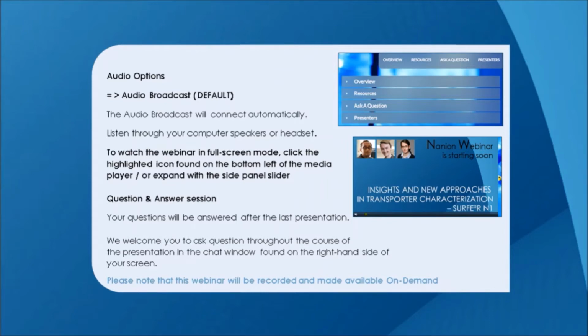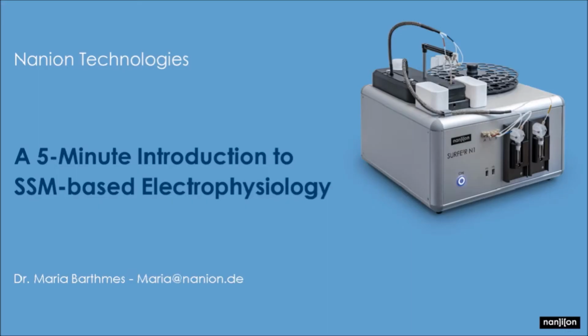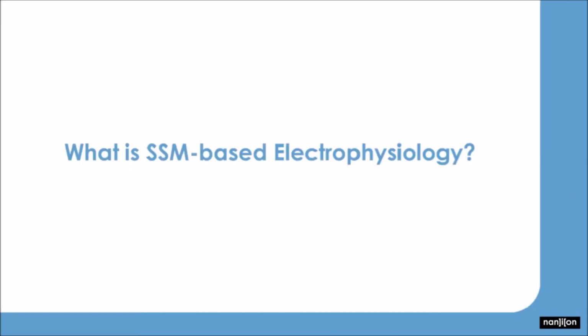As an introduction to the two following talks, and especially for those of you who are not familiar with the method, I am starting this webinar with a 5-minute overview on SSM-based electrophysiology. What is SSM-based electrophysiology? Very generally speaking, it is a method that enables the measurement of very small electric transmembrane currents. This makes it suitable to record the activity of electrogenic transporter proteins.